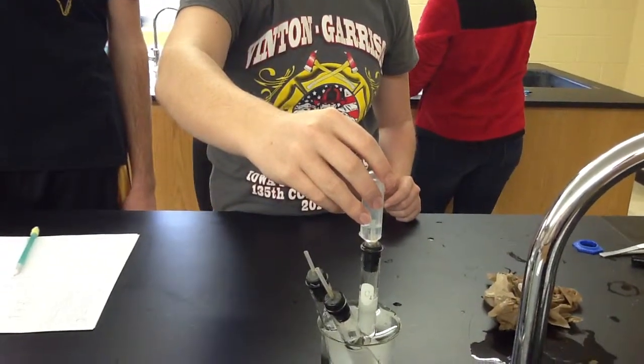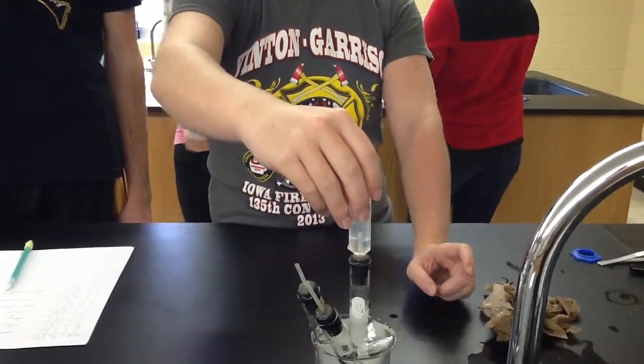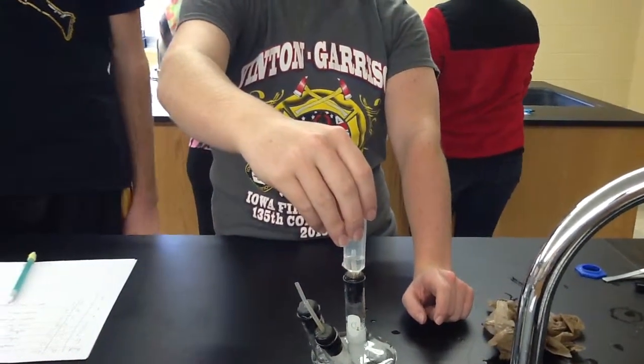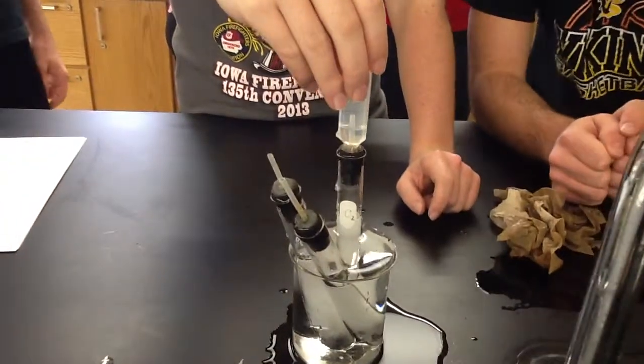So why do you have water in there? So that as it gets pushed out, we can tell how much gas we need. It is pushing water out, isn't it?